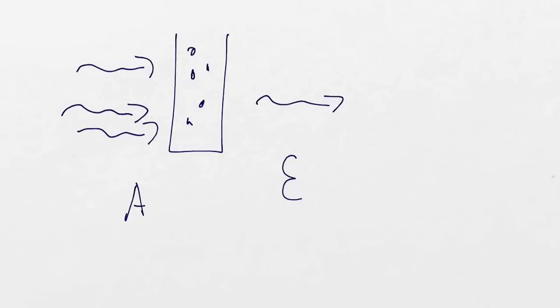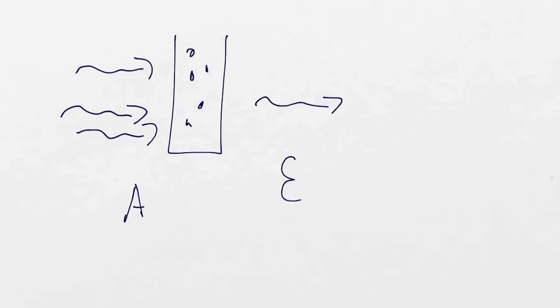Yeah? And people have determined extinction factors, so you can usually look up these extinction factors in handbooks and things like that. So let me give you a little example. Let's say we measure an absorbance of 0.2. That's our absorbance.